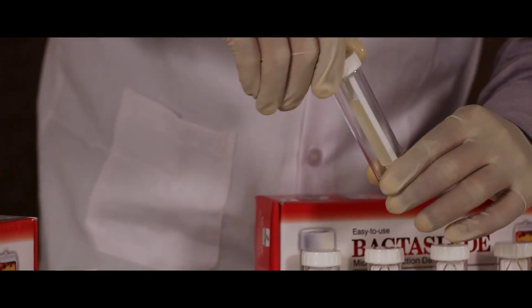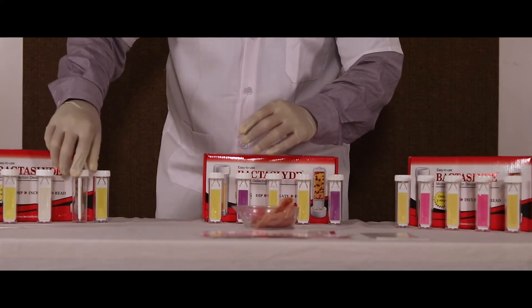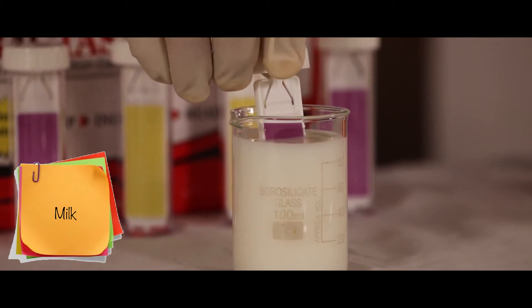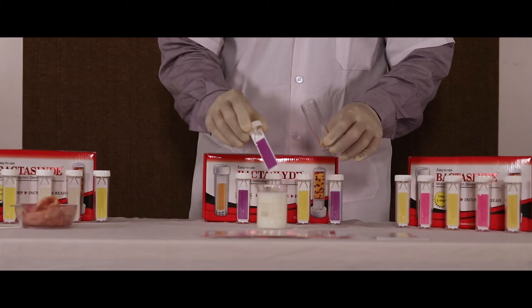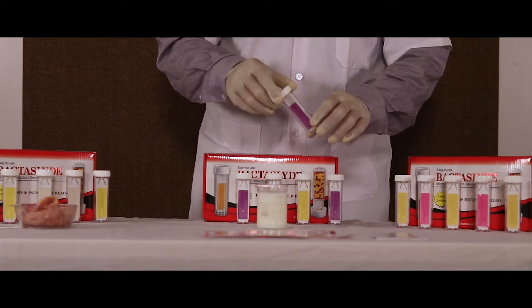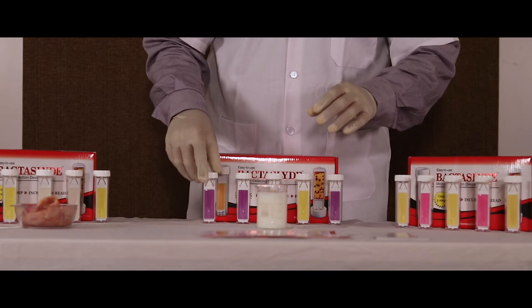Allow it to incubate for 18 to 24 hours at room temperature. For milk, open the slide and dip it in the sample for 30 seconds. Gently shake off the excess and screw the slide back in the tube. Allow it to incubate for 18 to 24 hours at room temperature.